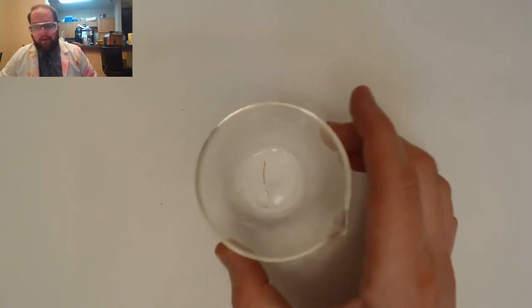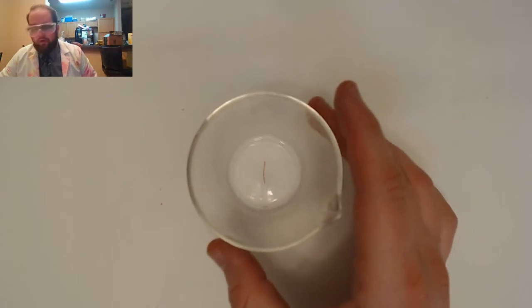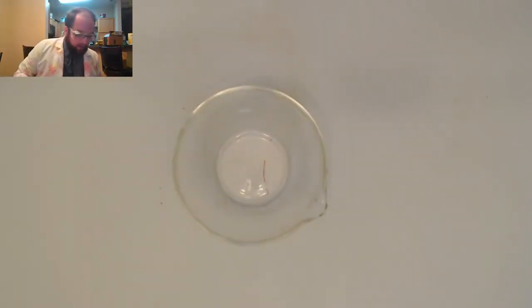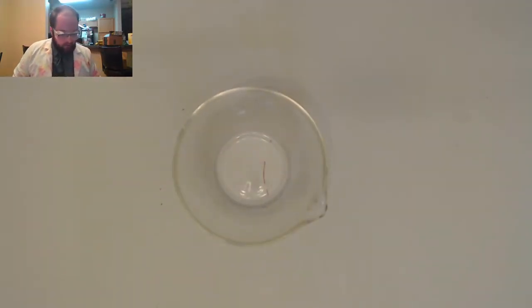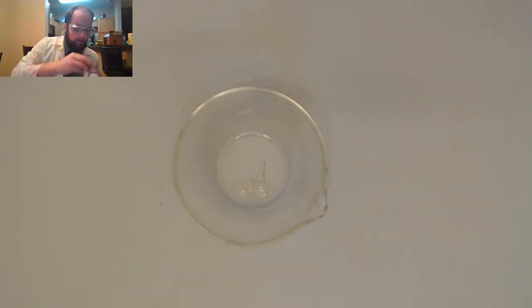Now, again, we're not going to worry about the calculations too much. But let's kind of talk about what's happening here. So right now, I've got in my little dish here a sample of hydrochloric acid. And I'm going to add a little bit of that indicator. Okay? Again, when I add the indicator to the acid, it should do nothing. Lots of acid in there. It is doing nothing inside there.